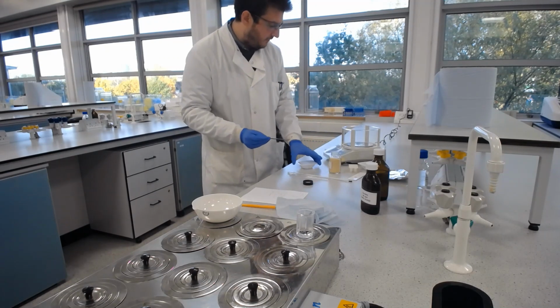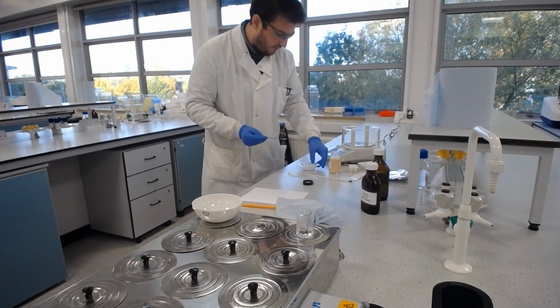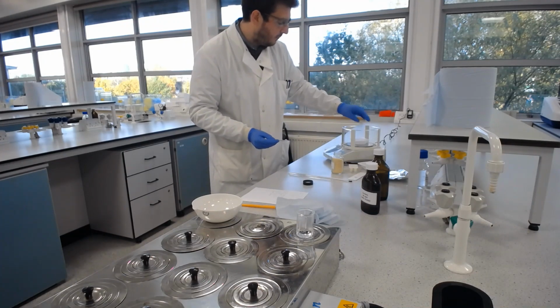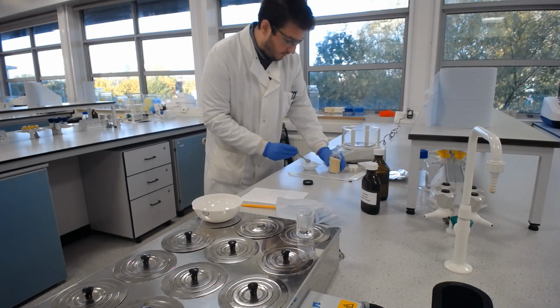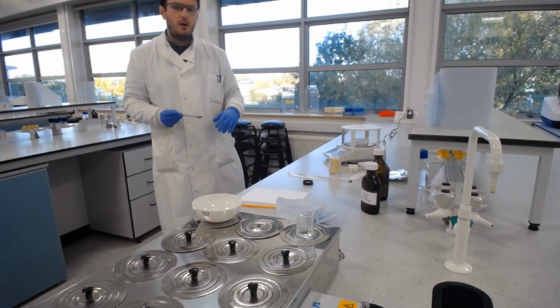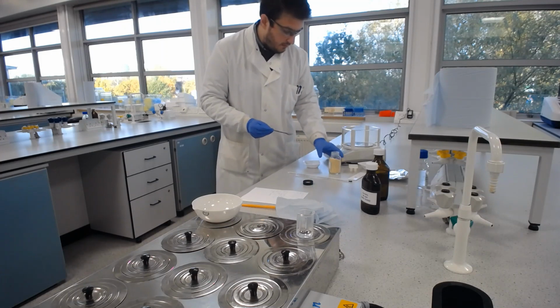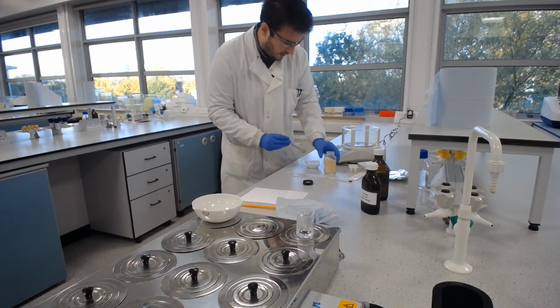I'm sure this is compulsive viewing for you, watching me weigh something out. We've nearly got 1.6 there. So you can see the way that I do this is that I'm almost going in smaller and smaller increments every time to get to the correct mass. Also, you're probably thinking, oh, Sir's not putting the lid on. That's because I'm getting a rough estimate at the minute. So now I'm at 1.583. I'm going to put the lid on and make sure that I've got an accurate mass. So that's 1.584, 1.583. So literally just the tiniest amount. Teeniest amount. And let's see how that goes.